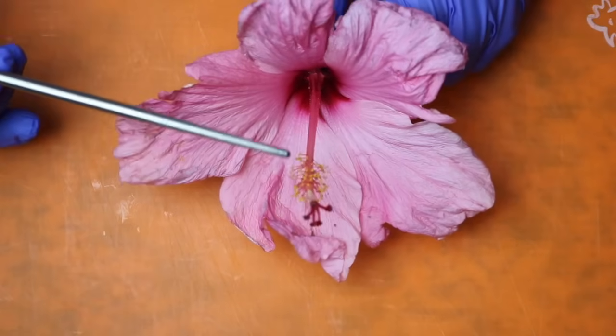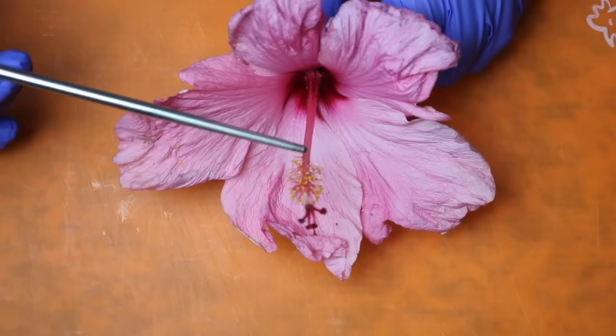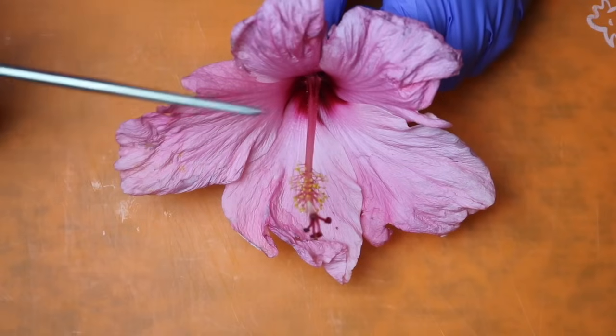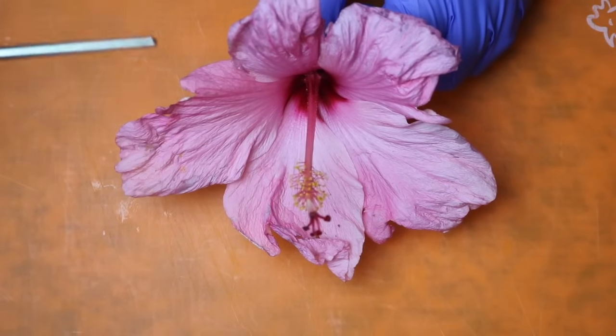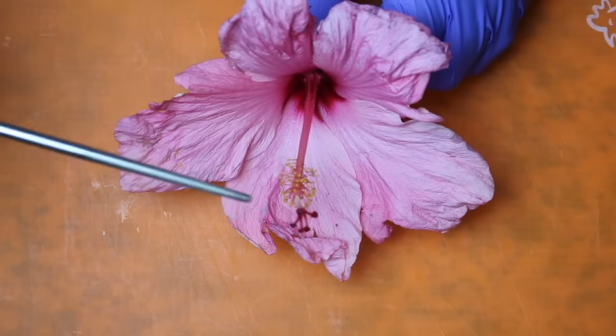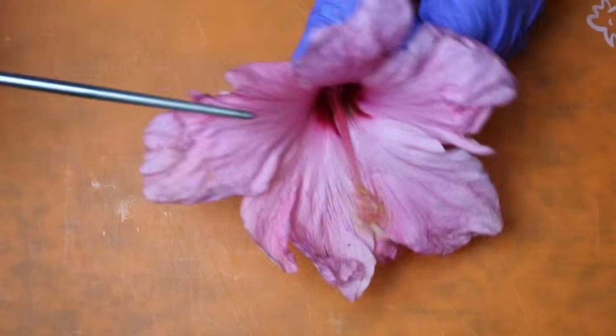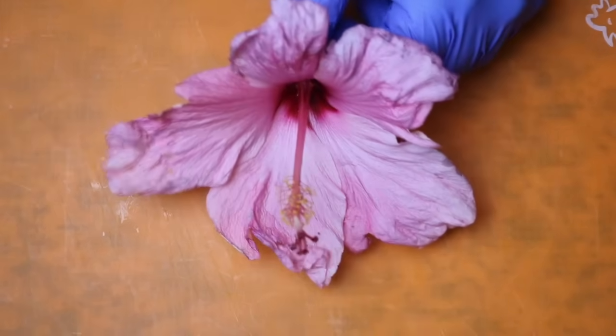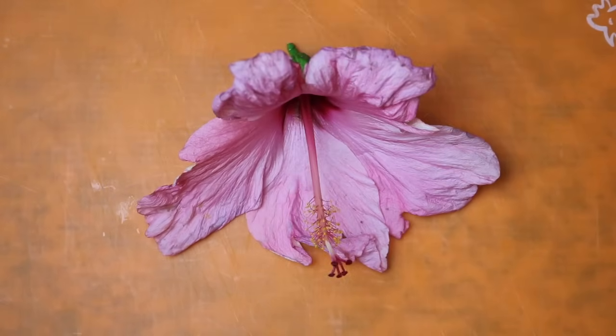Inside of here, we can see these parts with the yellow sticking off of them — those are the stamen, and those are the male parts of the flower. And right down the center, all the way down to this bottom part here on the inside, that is the female part of the flower, or the pistil.